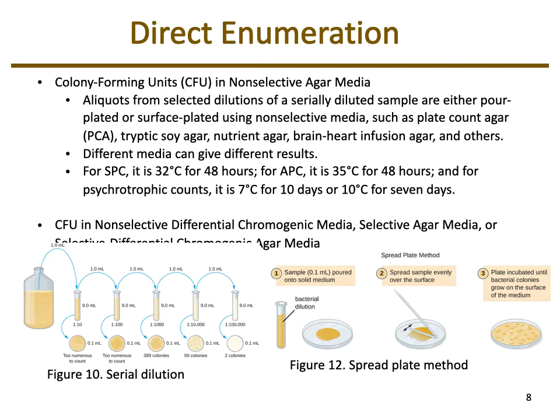You'll do a serial dilution. So you'll take your stock solution, and this could either be your food item or a set amount, like 1 gram, and then you dilute it into a diluent, and then you repeat the same dilution over and over again. So a 1 to 10 dilution, a 1 to 100 dilution, and then you take a small sample of that, and using the spread plate method, you spread that small sample out onto the plate, and then you incubate it and allow it to grow.